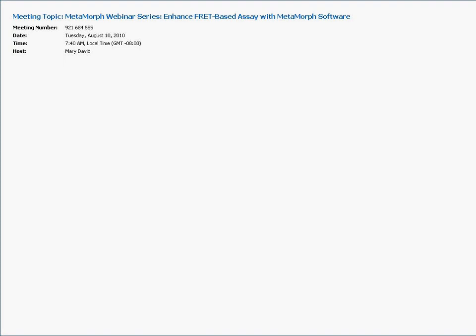Well, that appears to be all the questions for right now. Does anyone else have any questions for Ed? Oh, yes, Brian Schneider: is there a simple way to do ping pong FRET, DFA-AFD instead of DFA-DFA? To be honest with you, I've never heard of ping pong FRET, and so I don't have an answer for that.